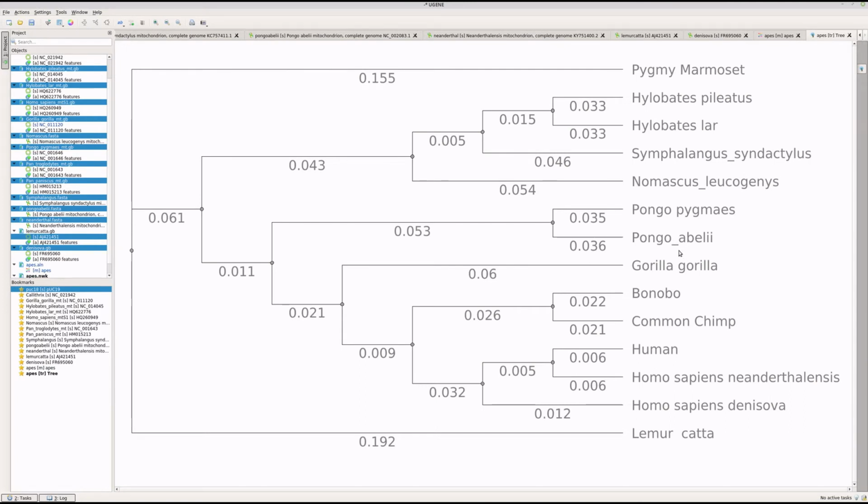So we have this new file, and here we are. Right? So we have a very basic tree. And as I said, this is not necessarily the best way to do it. However, if you look at our outgroups, the outgroups are outside of everything else. So here's the monkey, here's the lemur, and everything else is over here, right? That's the inexpensive way to do it. Not the best way, but if you want a ballpark figure to look at, here it is.